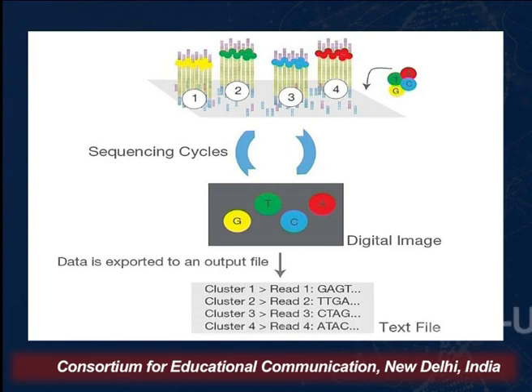These are basically termed short reads. These are short read molecules. These fragments will then be read, and as I said, you can see that the signal has been intensified because of the clustering that has occurred. Each fragment can be present multiple times and therefore give multiple reads.